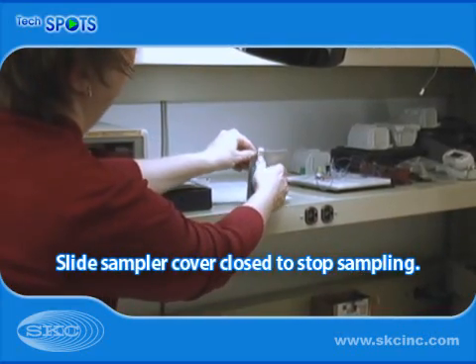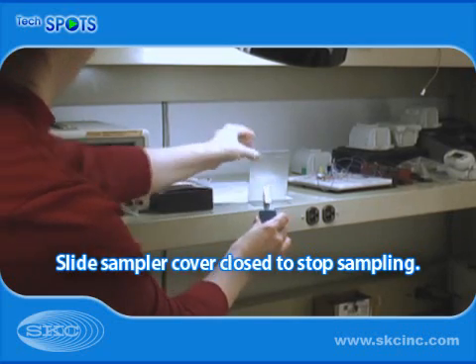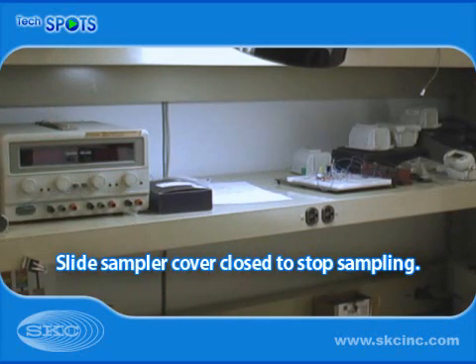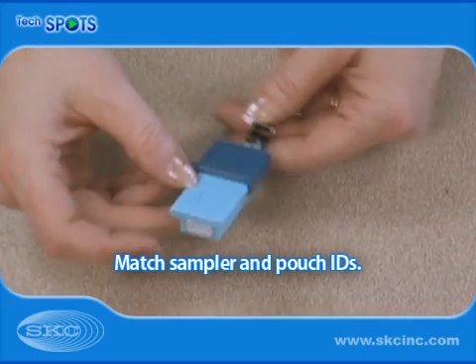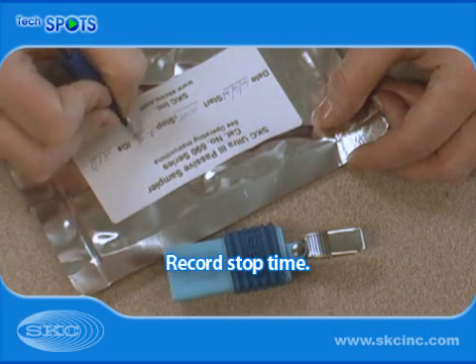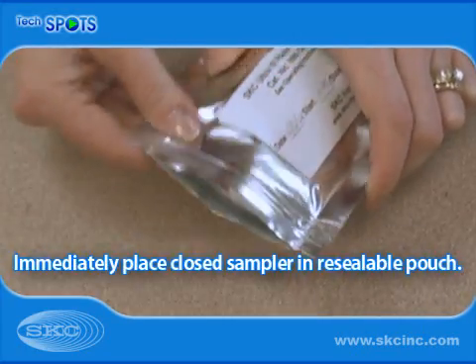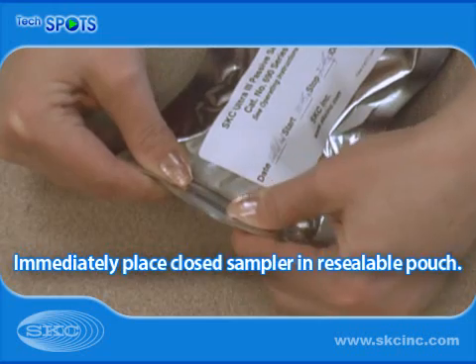After the desired sampling time has elapsed, unclip the sampler and slide the sampler cover closed to stop sampling. Ensure the sampler and pouch IDs match before recording the sample stop time on the pouch label. Immediately place the closed sampler in the pouch and seal.